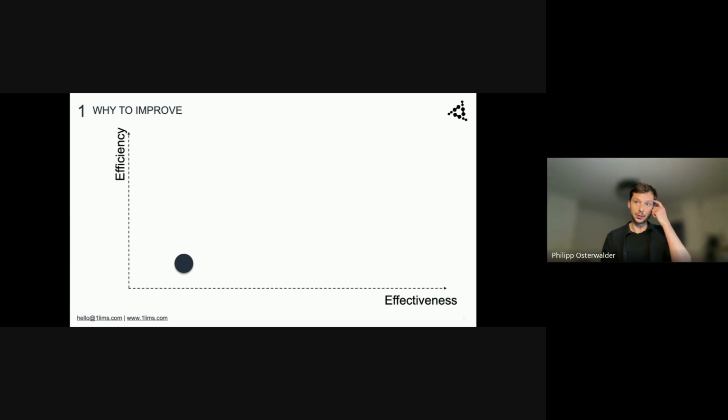We sometimes use in workshops the value stream map to visualize the value of each of the main processes, or even a SIPOC, the supplier, input, process, output, customer process map, which we generate together in an interactive workshop, mostly on site together with the lab team and our customers, to see and visualize these processes step by step and align all the responsible people on that.